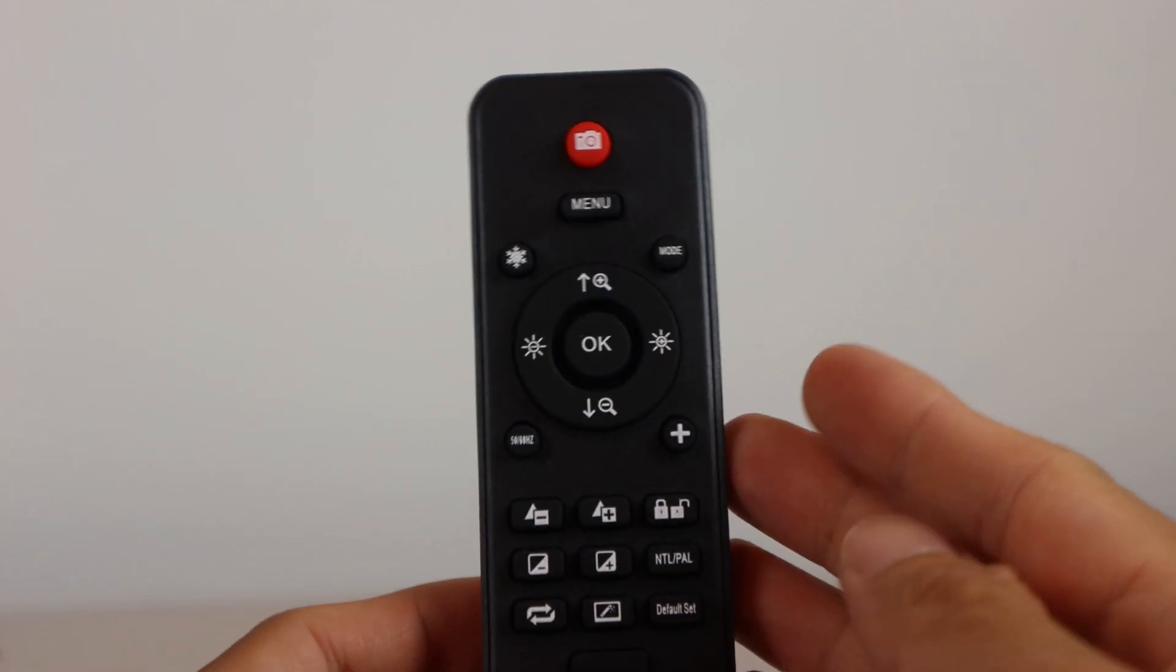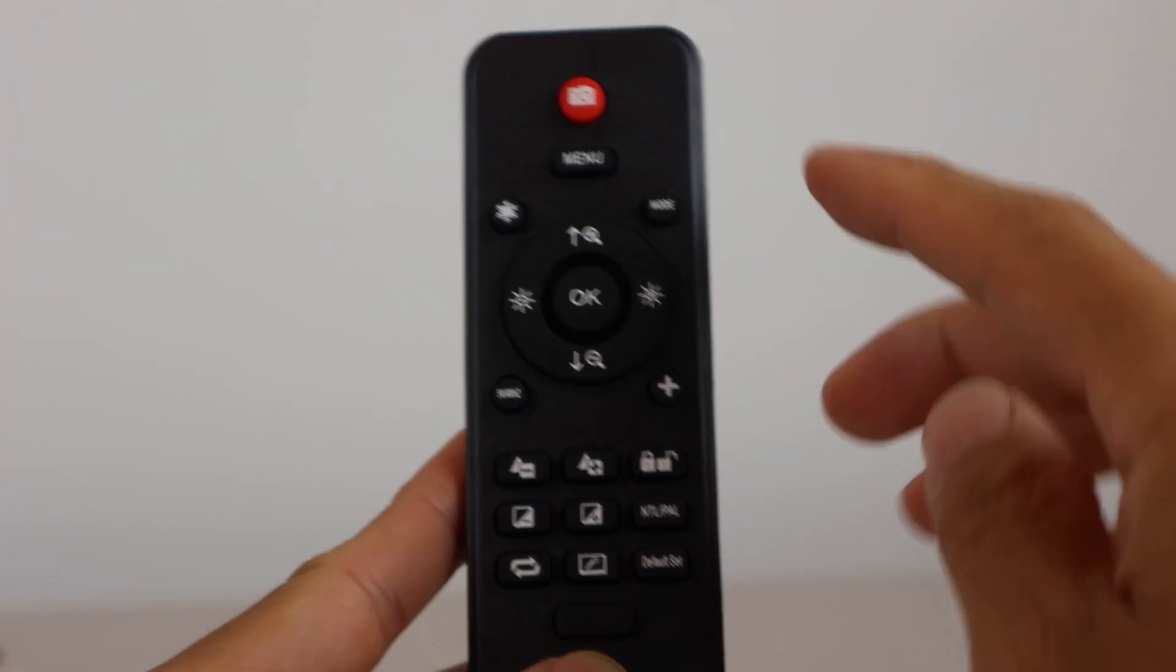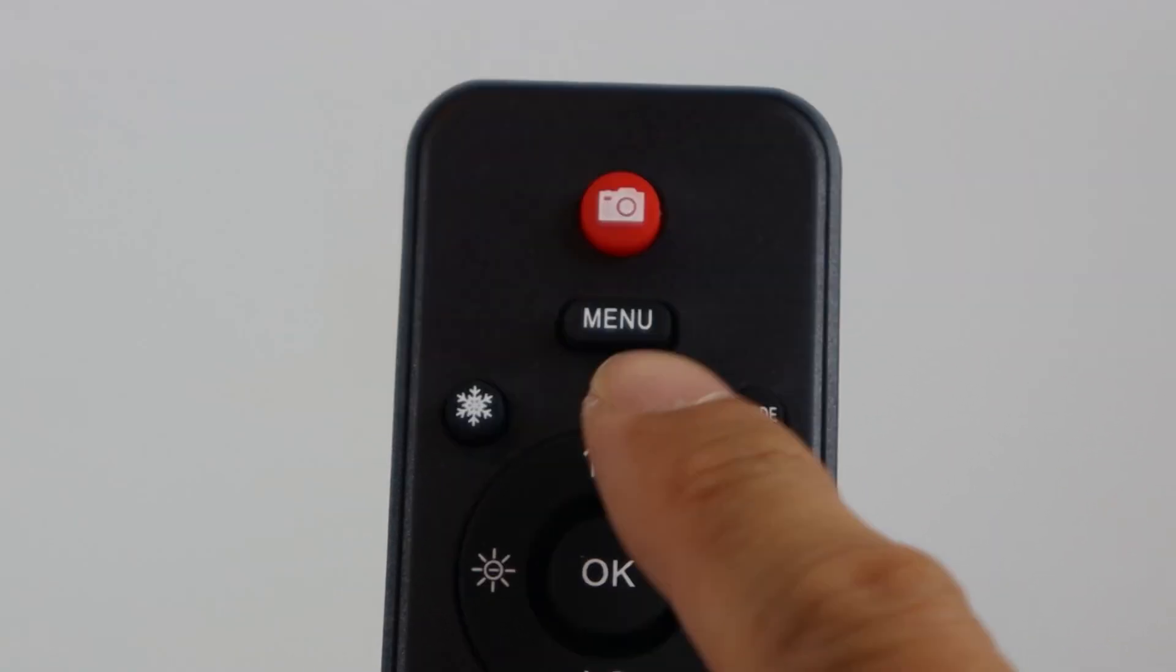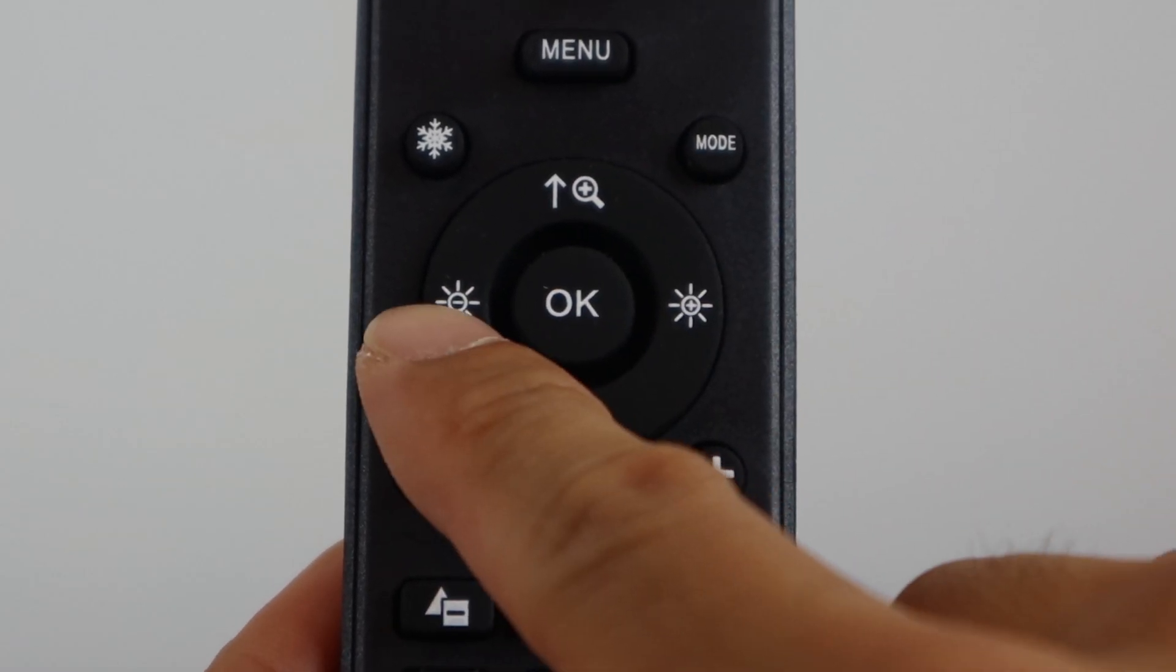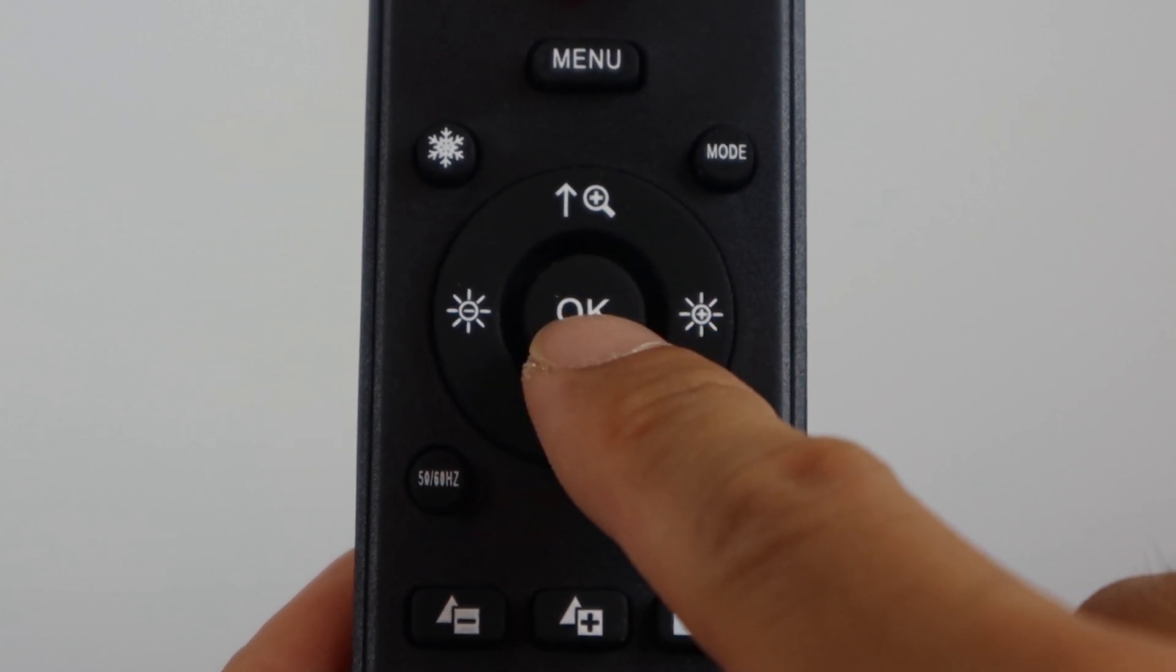The remote control has more options than the physical buttons. You've got a photo button, menu key, video freeze, mode, zoom in and out, exposure adjustment, and OK button.